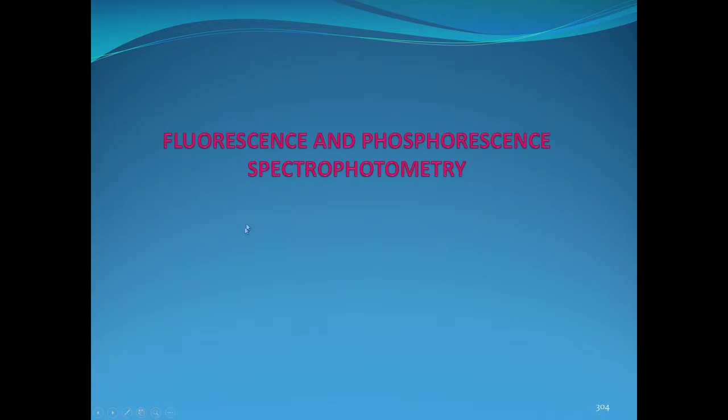Basically, fluorescence measurement is approximately equivalent to spectrophotometry, but phosphorescence measurements cannot be accessed through an accessory as a spectrophotometer. You have to have a dedicated instrument for phosphorescence, but for fluorescence there is an accessory available.